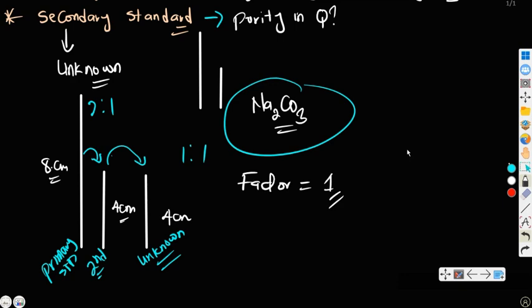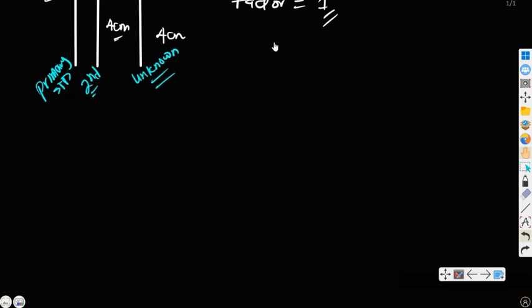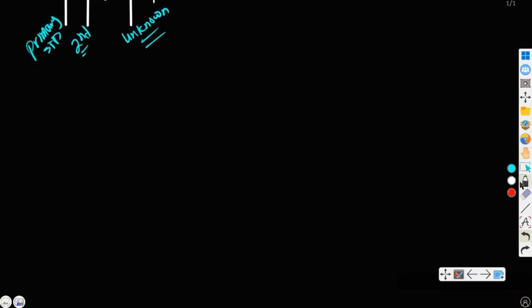Now, let us go straight to what titration is all about. Most times the titration setup usually involves something in a burette, which is the unknown concentration most times, but not all the time.